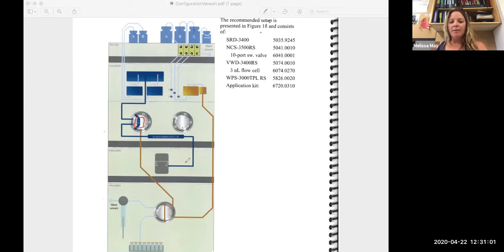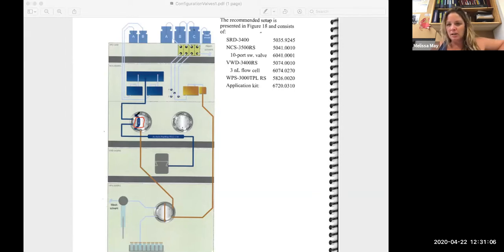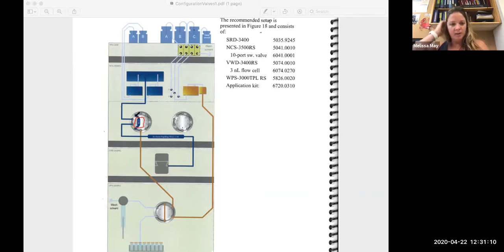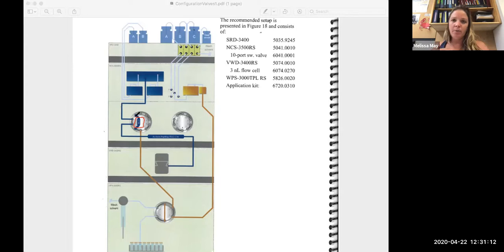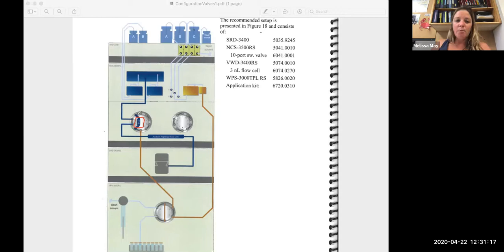And so that 15 minutes is taking it to pick up that one microliter, load everything onto the C18 column, make sure that your one microliter of sample has gotten there, and that things are equilibrated before you're going to actually put your column in line. So when you change that valve position, what happens instead of this going out to waste is it goes in this direction.